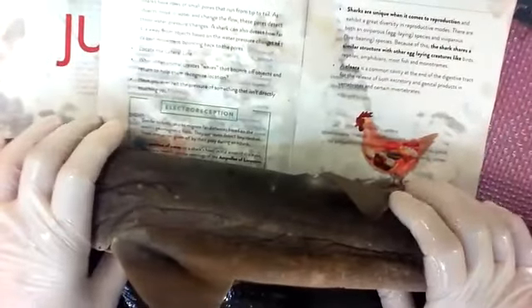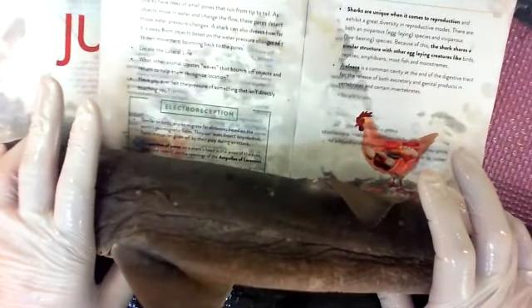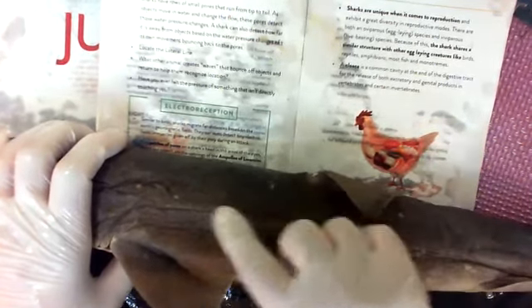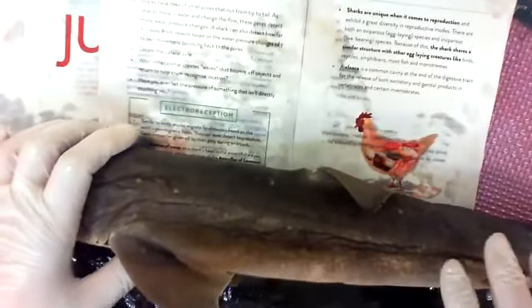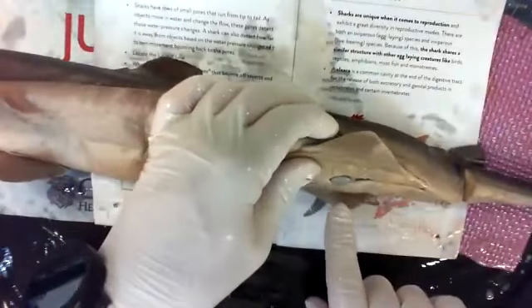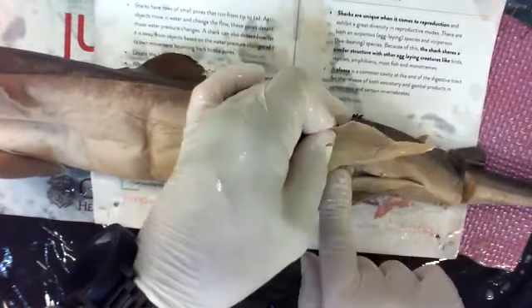But let's say that there's a shark that it's babies, which, do you know what the name for a baby shark is? I made you hum the song in your head, didn't I? So catchy. They're called pups. So they can have the eggs, plant the eggs in seaweed or whatever and hope they're protected. Or they can make the eggs and hatch the eggs inside of them and then let the baby shark pup come out the cloaca, which is the hole right here between the pelvic fins.